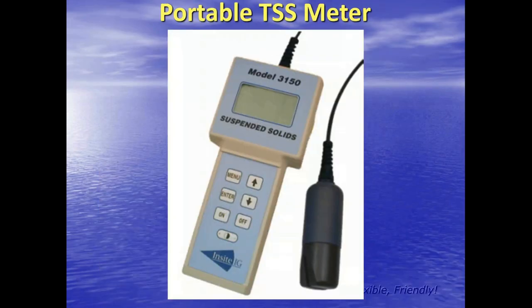So another method of measurement of the blanket, let's say, in a tank would be a suspended solids meter. The probe has a gap down there on the business end, and there usually is a light source, and it's calibrated to certain densities, and when it goes past an area of a certain density, it'll beep at you or give you a light flashing or what have you. The cable that's lowered down with that probe is marked every foot or so.